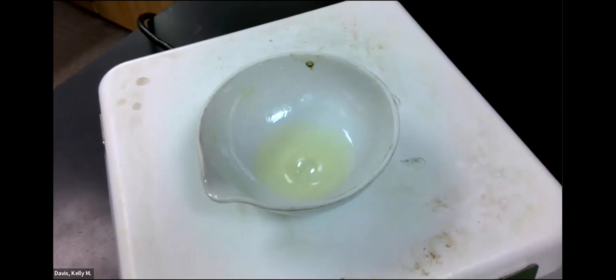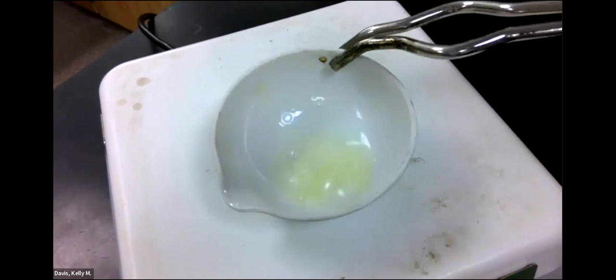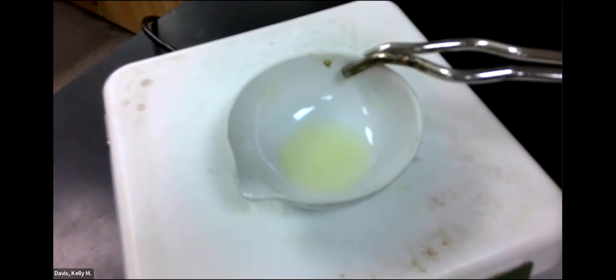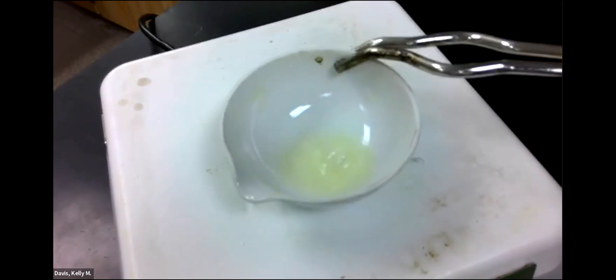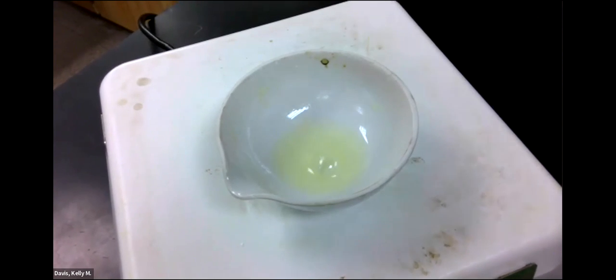Okay, it's been about 10 minutes or so. We're still boiling off the water. It looks a little thick in there. It's definitely less water than before. You can start to see the solid magnesium chloride form around the edges a little bit. And we've had a little bit of splattering, not too much. And I'll just let it keep going.